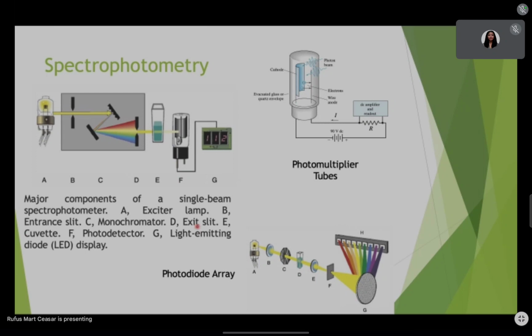So, kunwari, may nag-strike na, okay, ulit tayo. Ito kunwari, isang electron, isang dynode. Kunwari, may isang dynode. I-strike niya to. Yan yung first dynode. So, after nung first dynode, mag-emit to ng secondary electrons, 3 to 6.